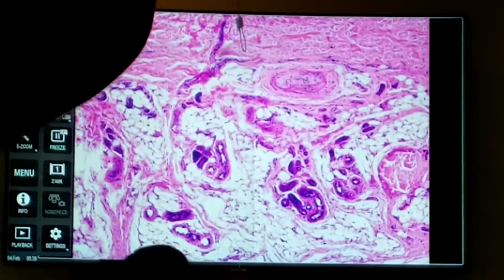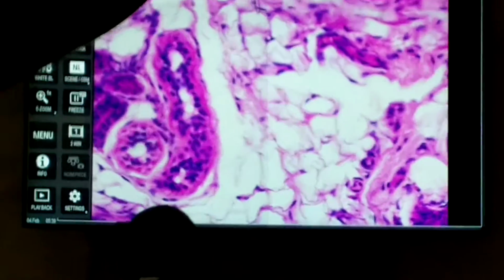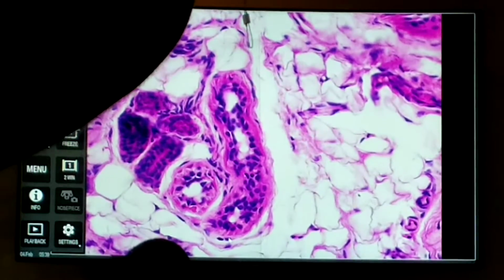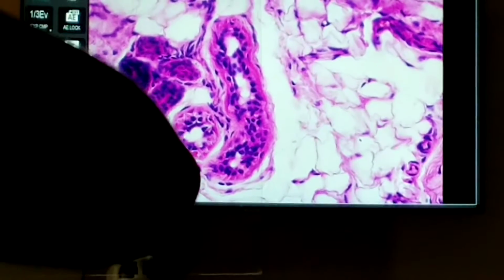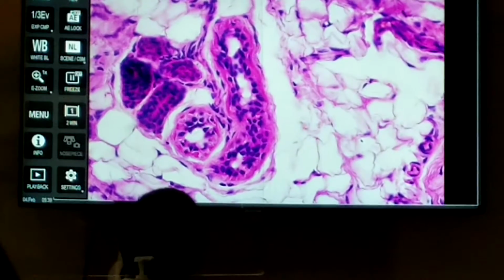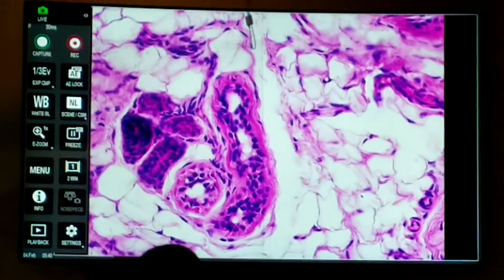These are clusters of sweat glands. Now, this is the secretory unit here. You see one layer of cells, there's a nucleated cell right there. Again, these aren't well defined, but these are nuclei. Here's a second set of nuclei here. So this is a secretory unit.